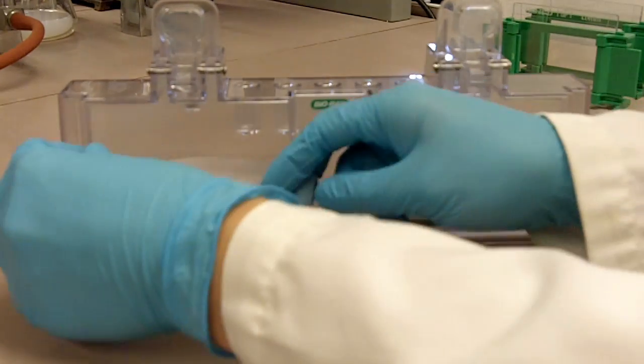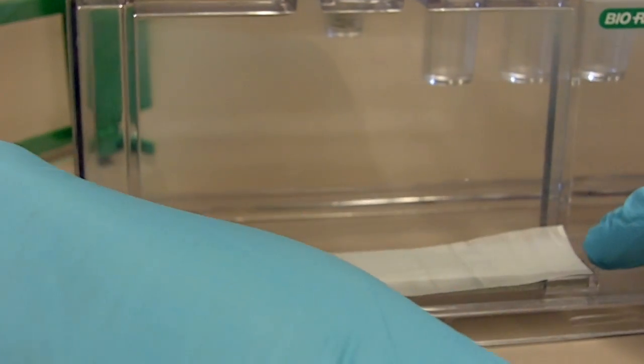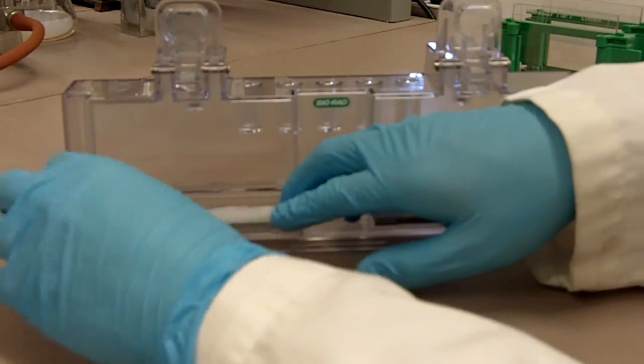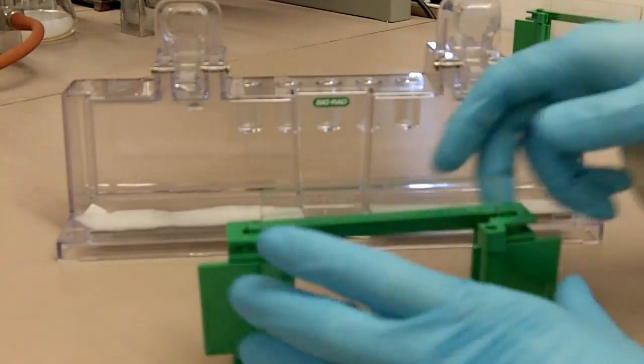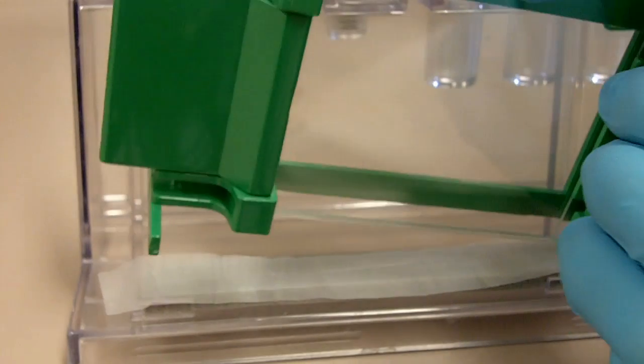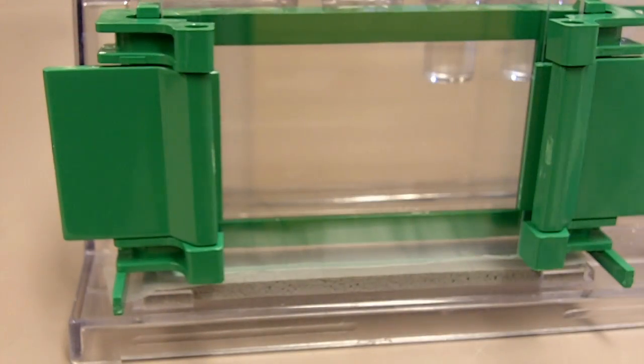So it's long enough to cover the seal. So we'll place the parafilm directly over the seal like that. And then we'll just put on the glass plate like usual.